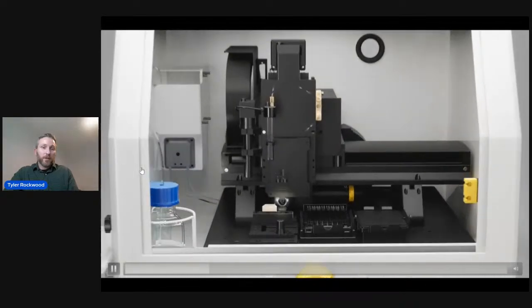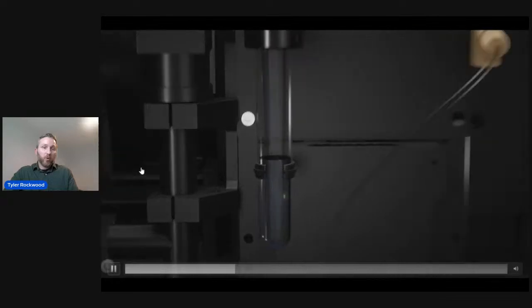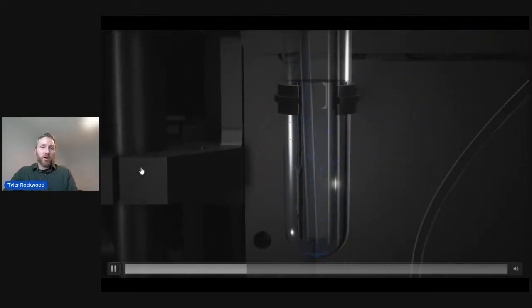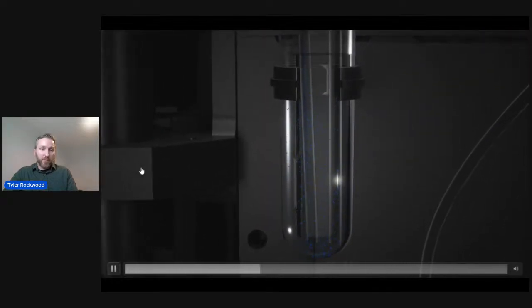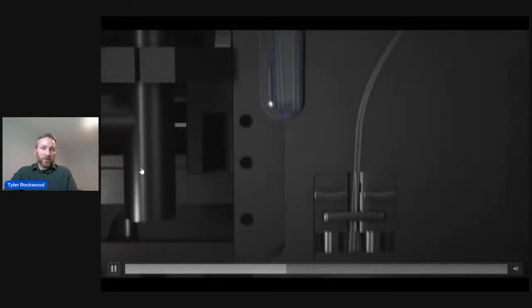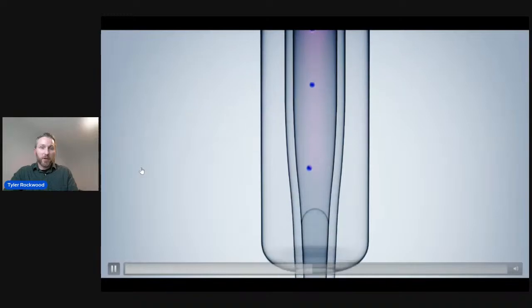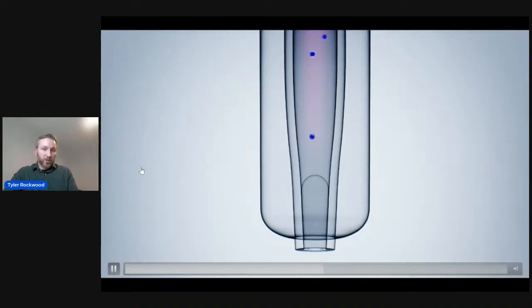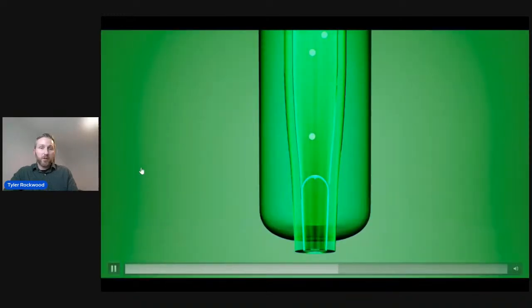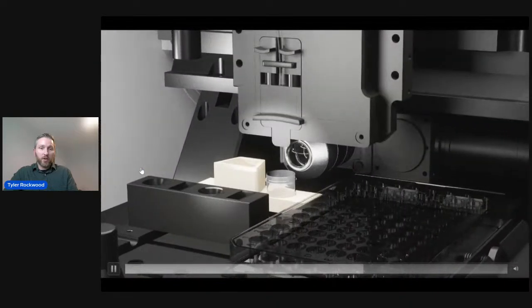Now, one difference is that this no longer uses an aspiration step. The sample holder here will be a tube and does an automatic resuspension of your sample spheroids. This also means that the priming of the system and loading of samples is more automated. This allows it to be a much more user-friendly experience, but in the end, we are still using image-based isolation, and we still have the 4 fluorescent channels that are used for isolating.